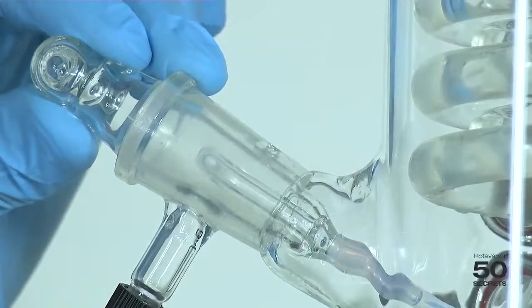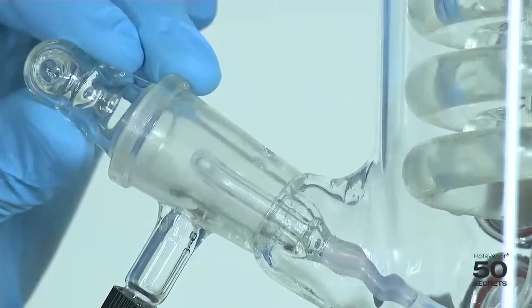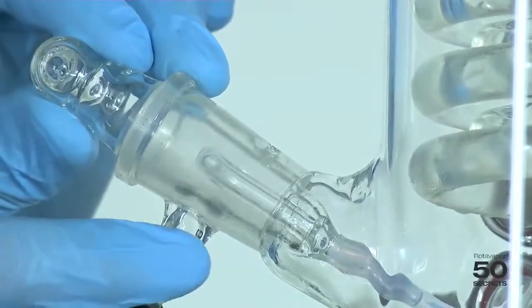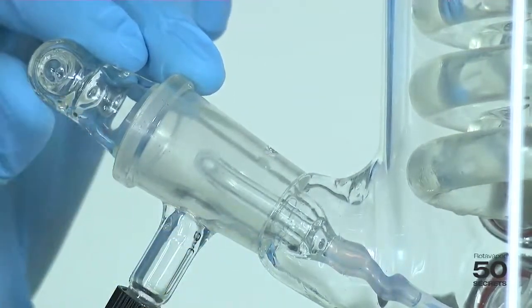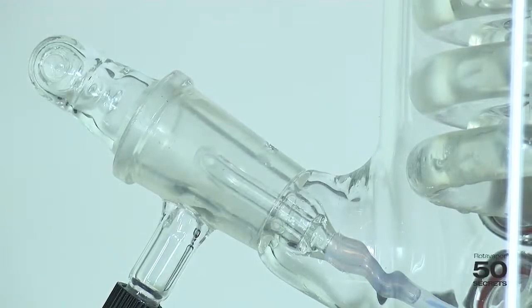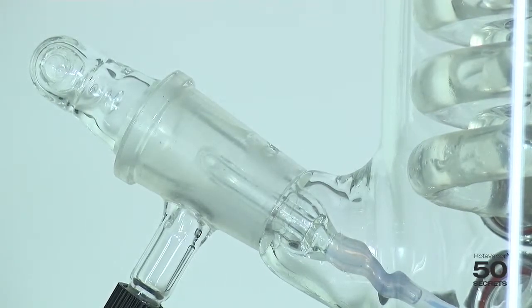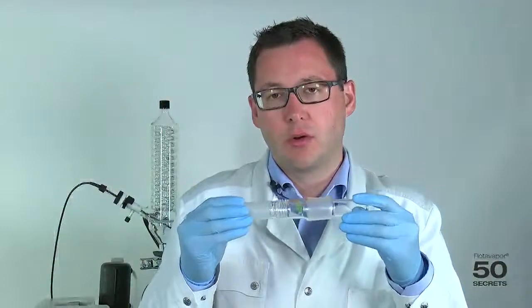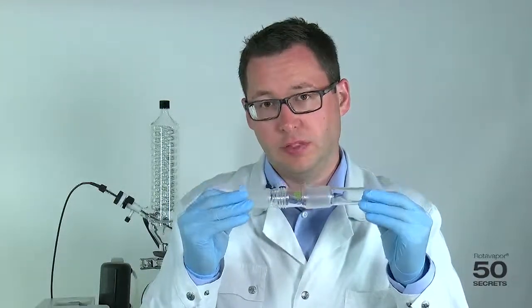Now we have a different stopcock, and we can see that even with this one the system is not tight. When I move it up, air can leak through this area over here. Now we are applying vacuum and you can immediately see that there are a lot of areas where air is coming through. Now you understand how complex it is to manufacture such an item as a vapor duct, and how difficult it is to control all these quality aspects.